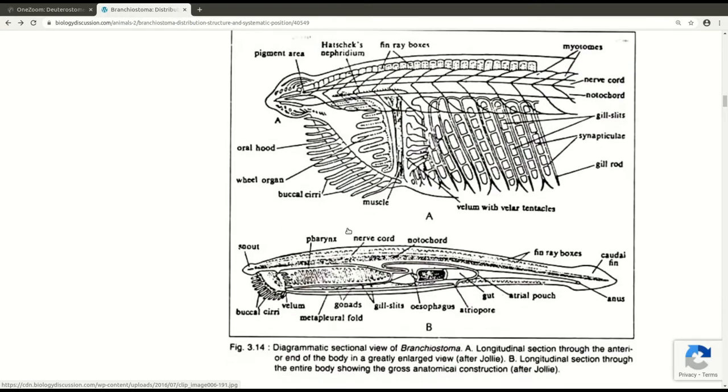So this is quite a nice diagram showing the internal anatomy, and maybe we can use this to start to identify which of our sections are cranial, which of them are caudal, and what structures we might be able to see. So as I mentioned before, we're probably going to miss out on all of these mouth parts here, which are the apparatus to get water flowing into the digestive system. But we'll probably get the nerve cord up here at the top, and then underneath there'll be the notochord. We'll probably see some of the pharynx as well, with its gill slits, and we'll come onto those maybe in another video.